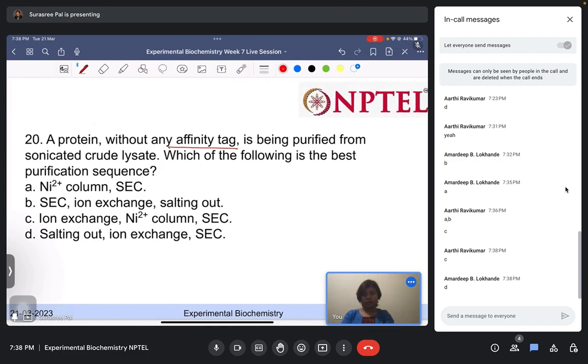And this I had not mentioned before, but when we are using multiple chromatographic techniques or multiple chromatographic steps, we should remember that the protein yield will also become smaller and smaller with each purification step, because in each purification step there will be some loss of the protein.